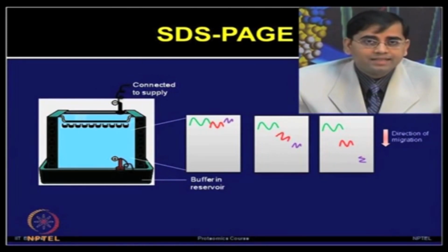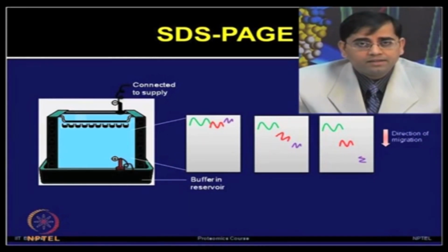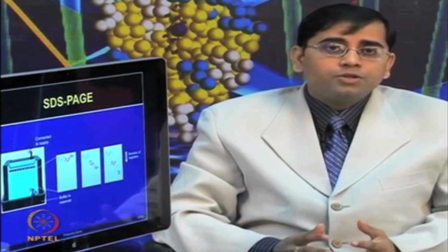So, depending upon the protein size, you can separate the protein based on the lower and higher molecular weight in this SDS PAGE gel. You can add the standards or known molecular weight proteins to determine your unknown proteins. I think it is important to clarify that in 2DE, when you use SDS PAGE, you do not need to make these wells by adding a comb, because you already have a flat IPG strip which has done the first dimension protein separation. So, in this case, you need to make a flat well, so that your IPG strip can be placed on top of the SDS PAGE gel. Again, to remind you, here you are only making the resolving gel for better resolution and separation of the protein. The stacking part is not done for the 2D, which has already been done during the first process of IEF.